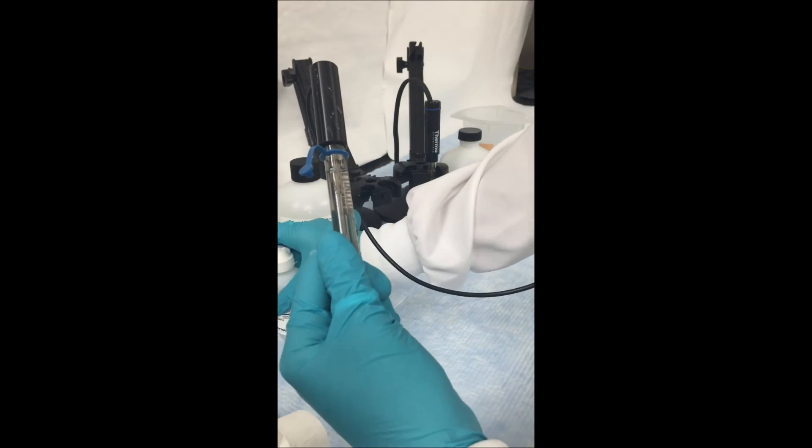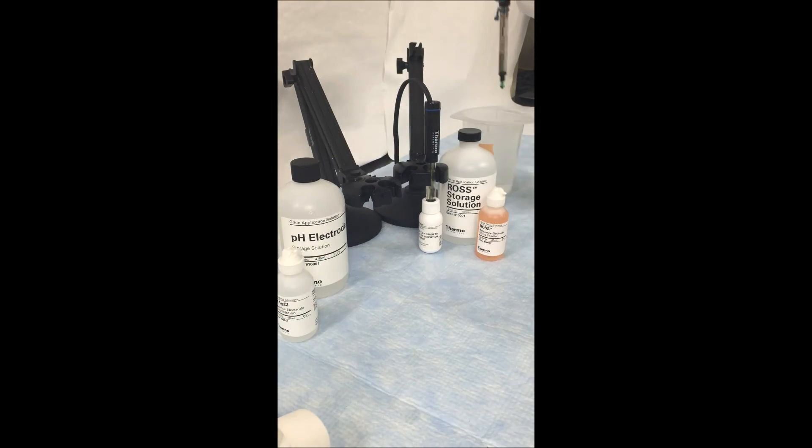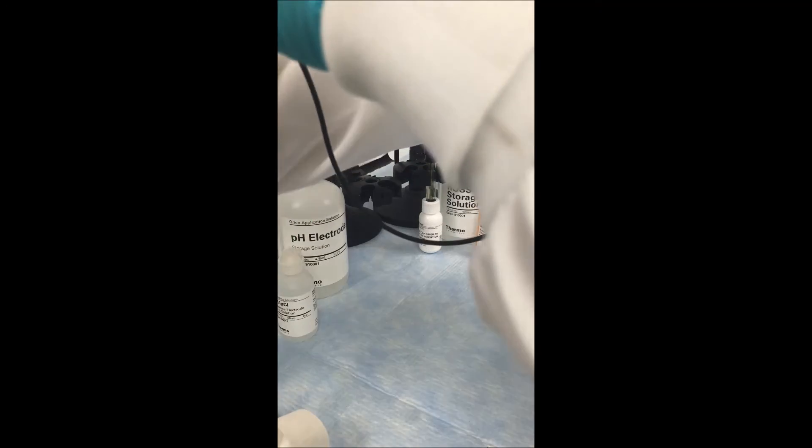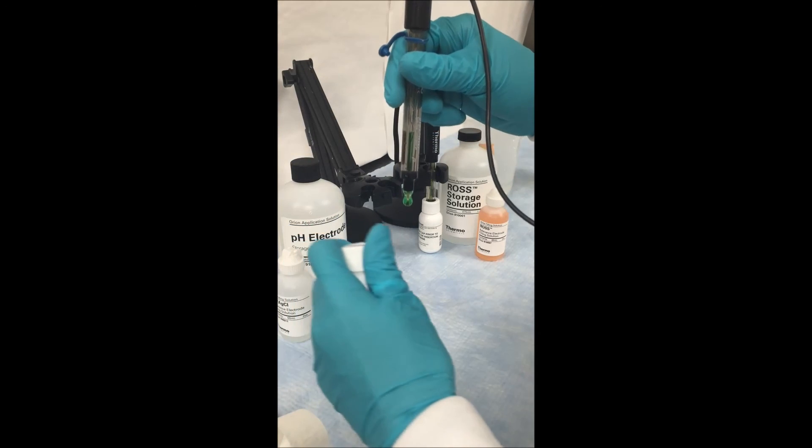Once the electrode is filled, you may rinse off your electrode with some deionized water if there is any excess fill solution. Now your electrode is clean and ready for use. Either put it back into storage or you may start using it on your samples.